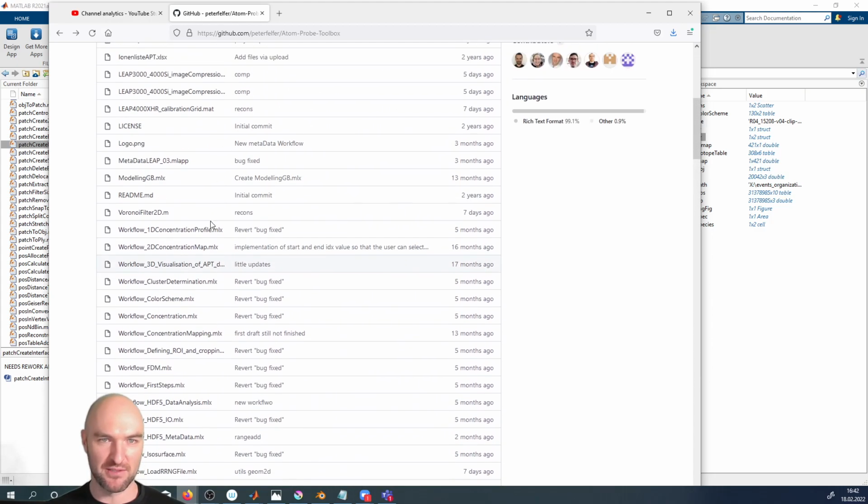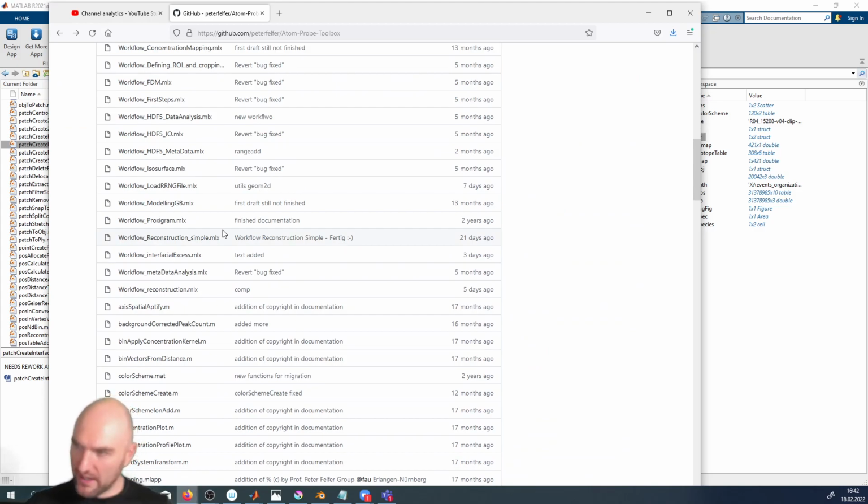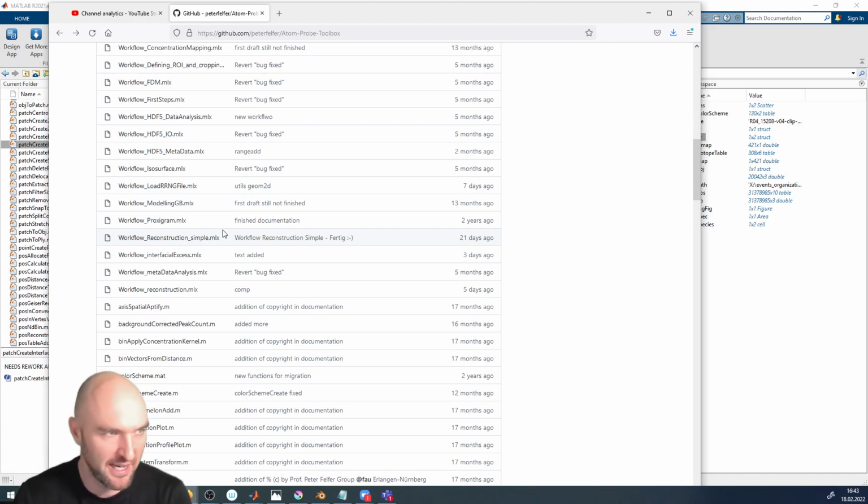Yeah, but we're doing our best to migrate everything that we have into the toolbox, and maybe also to get some external stuff to go into the toolbox. For example, the guys in Norway have done a lot of cool stuff with their user interface based MATLAB analysis thingy, and they have implemented some of our codes in there, and maybe we can implement some of their codes in our much more scripting based approach, because our approach is meant to really power automation.